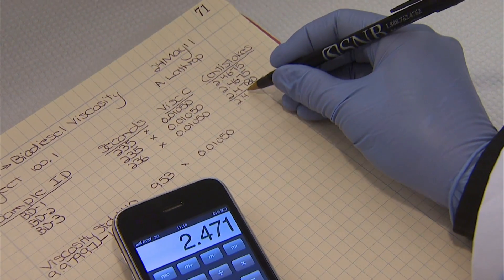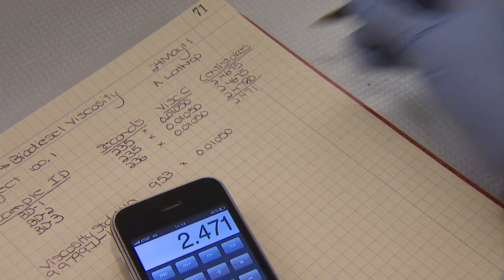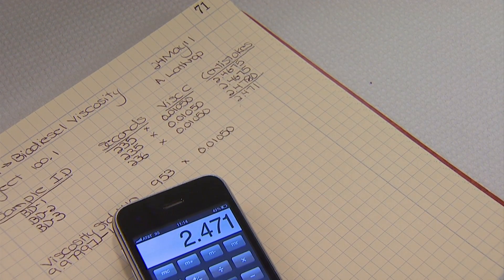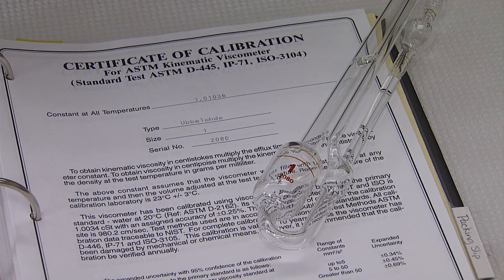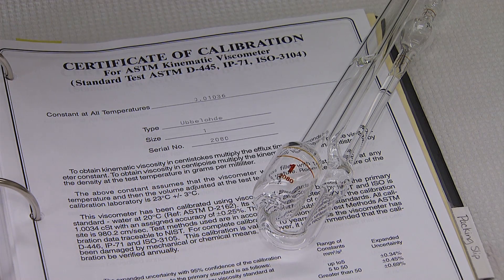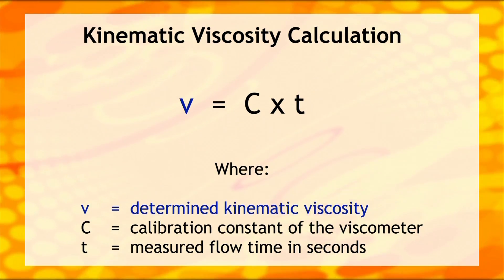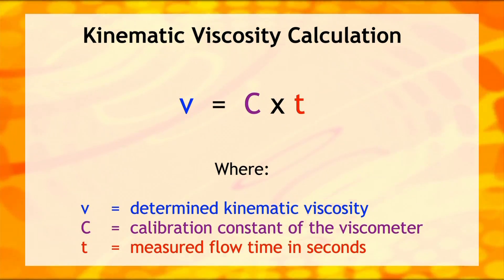Repeat the measurement two more times for a total of three measurements. Calculate the kinematic viscosity of the sample using the constant listed on the viscometer certificate. The kinematic viscosity is calculated by multiplying the measured flow time in seconds by the viscometer constant that is determined by the manufacturer. This calculation yields a result in the units of centistokes.